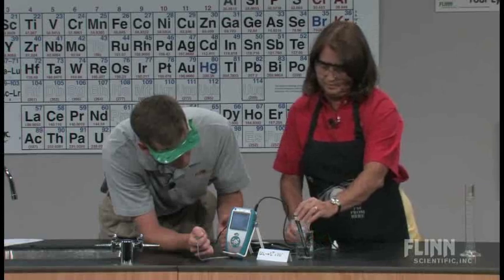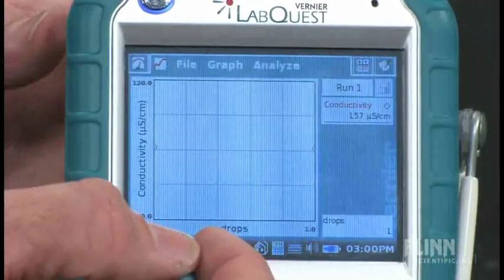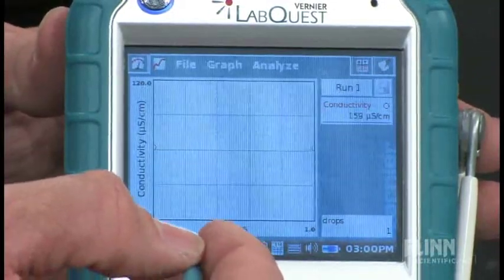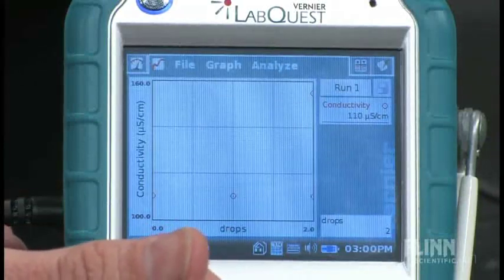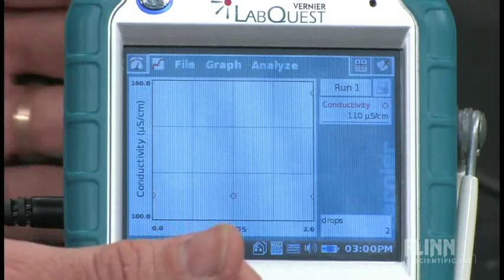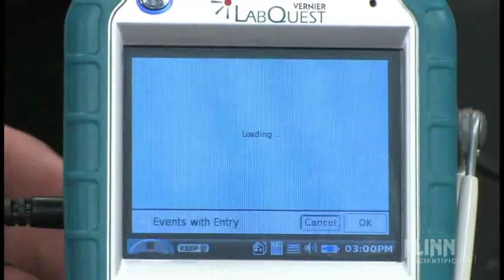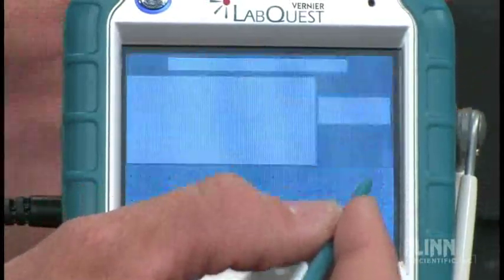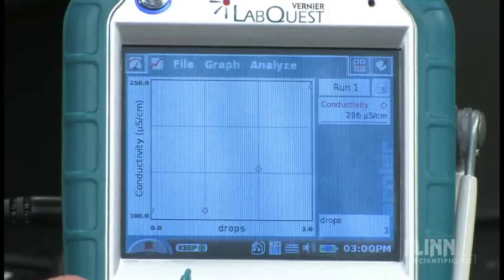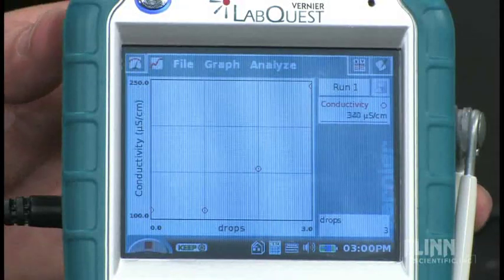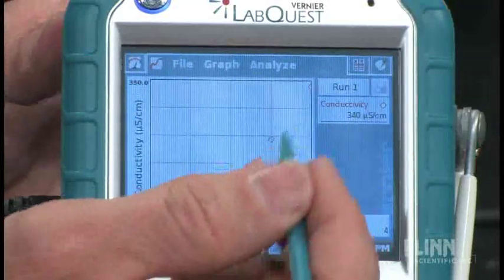And now we're going to put two drops in. A second drop. I'm going to hit the keep on that. So now we have a total of two drops of calcium chloride in there. And we'll go one more drop. And a swirl. And that's three. And then a fourth drop. When the conductivity stabilizes, we hit keep, and we have a fourth drop in there.